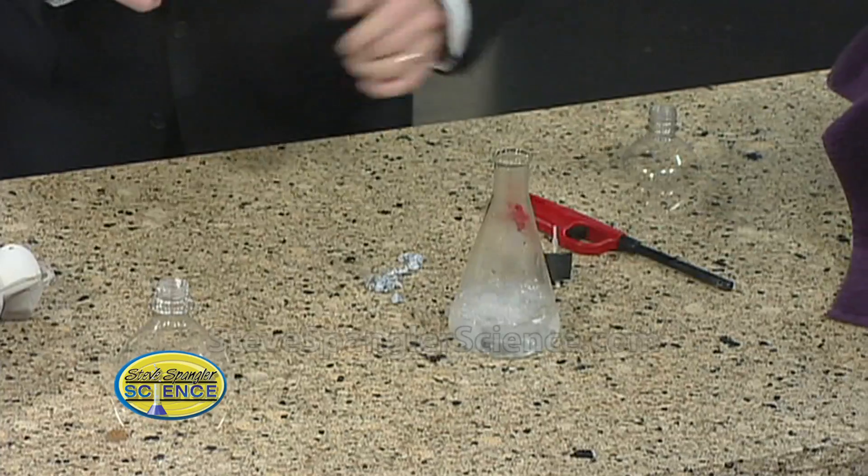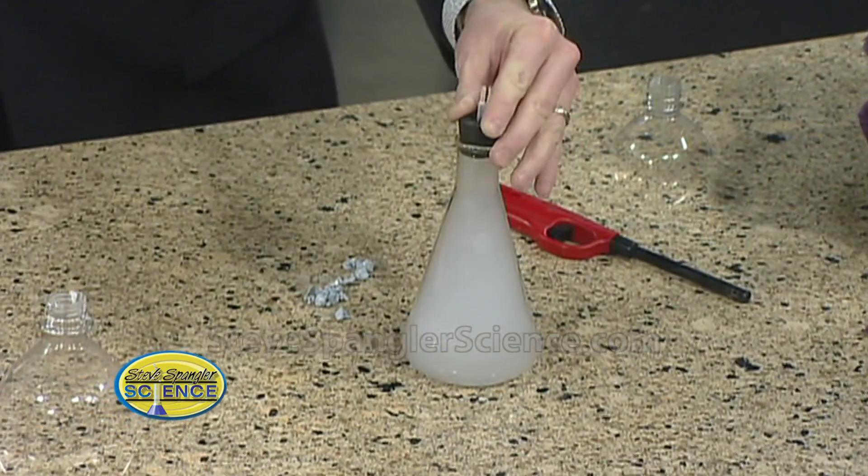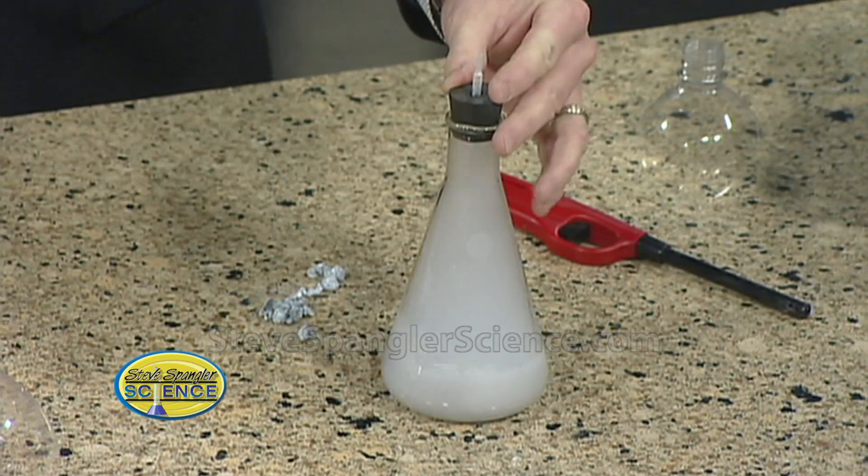So here we go. We throw the zinc inside. You see how it's starting to generate? Oh, and here it comes. So now we're going to put this over the top like this. See how it's generating the gas? That looks like a fire department problem right there.